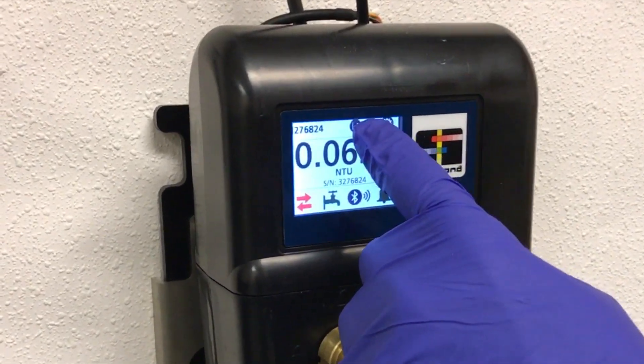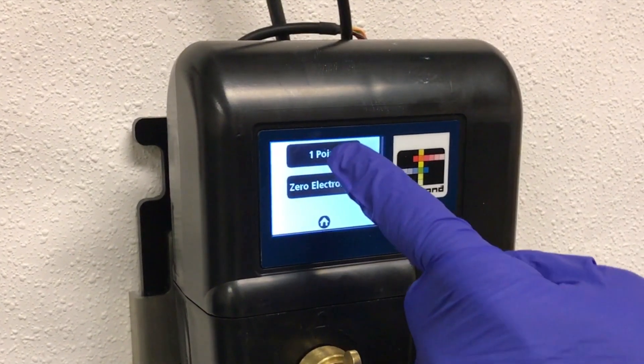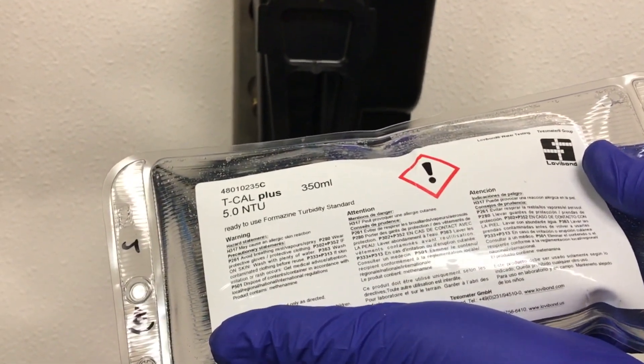To begin a calibration, press the calibration button on the PTV's touch screen. Then press the one point button to begin a one point calibration. In this example, a TCAL Plus 5 NTU standard is being used.